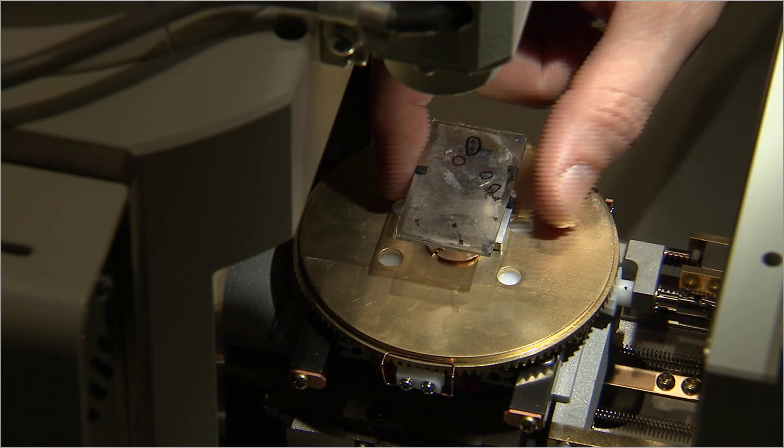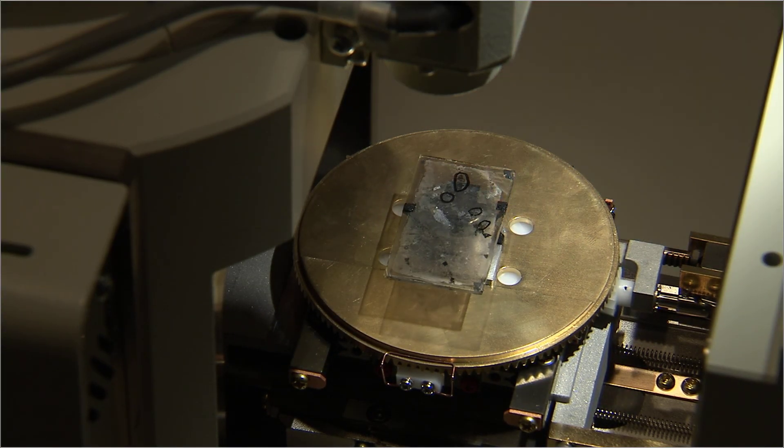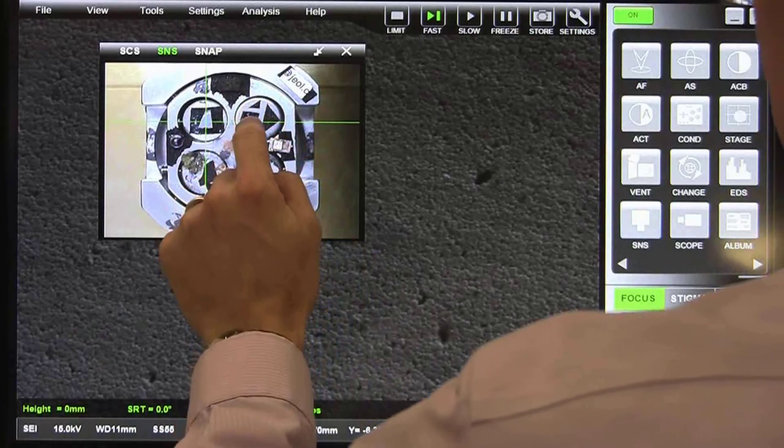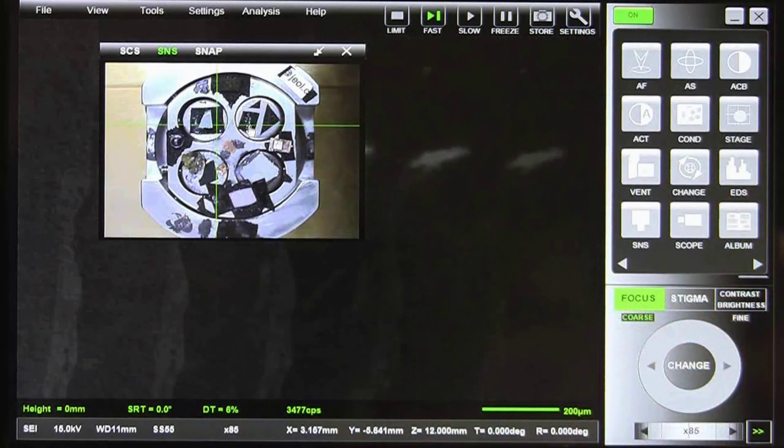An optional motorized stage and stage navigation camera help the operator quickly pinpoint areas of interest on the sample.